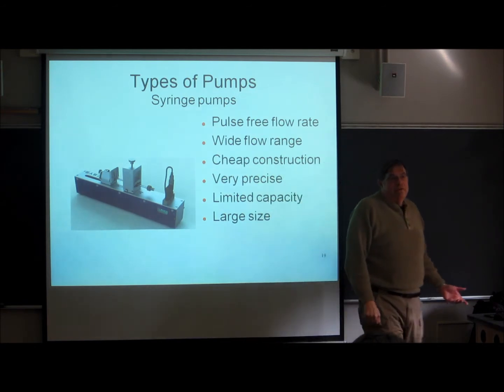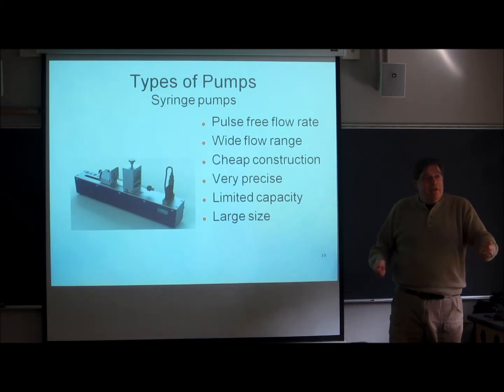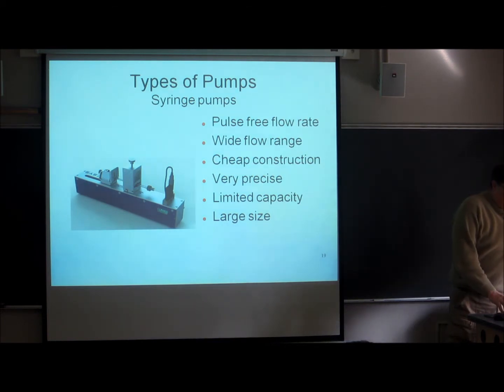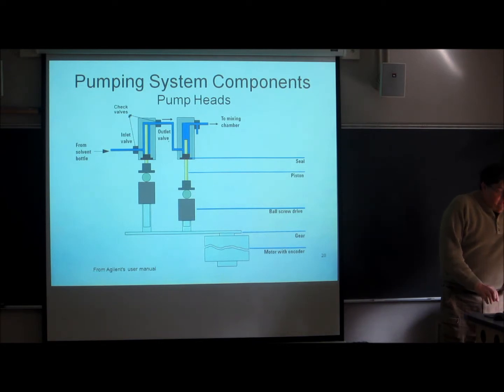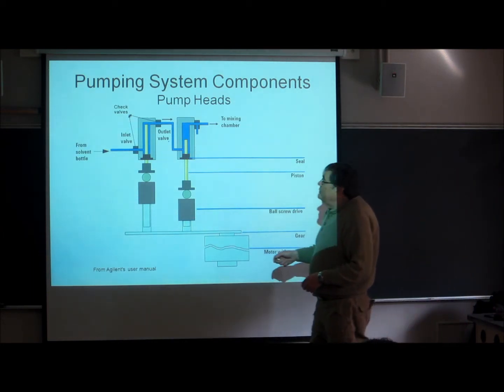There's a limit there because you have to refill it. So if you get 10 mils of solvent through that, you've got to stop the experiment, refill it, and then start it again. But for short-term experiments, it works very, very well, and it's not subject to pressure glitches. It's very precise, too. Let's see, I can show you this, I think. Also, well, we might as well use this picture. It shows up in the next one, too.